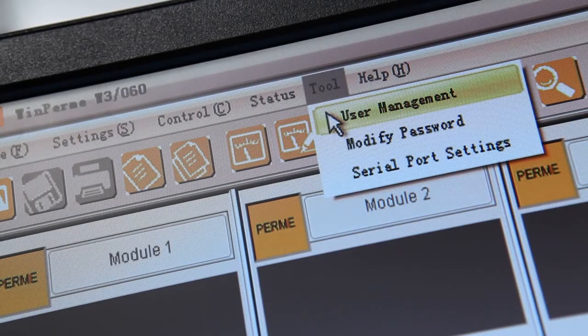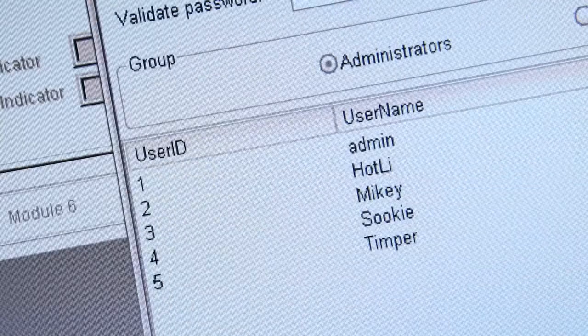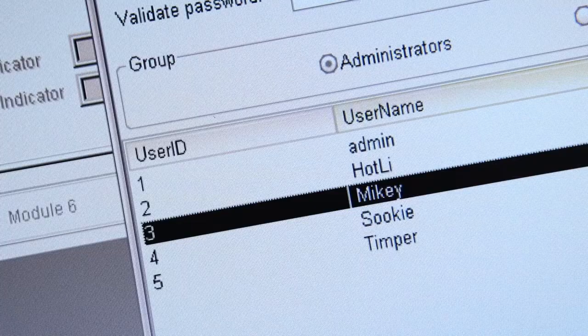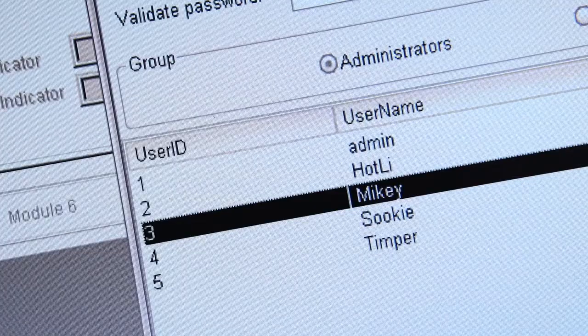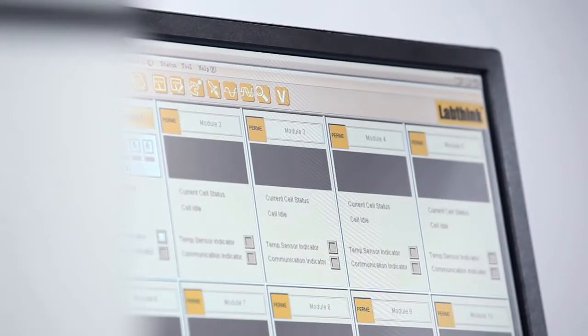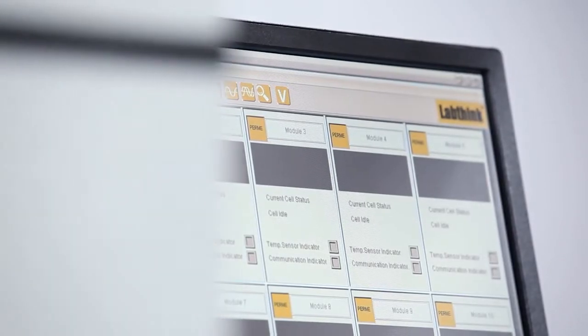The software can be used to track and manage test records of multiple users and allows users to operate and monitor all the connected testing modules at the same time.